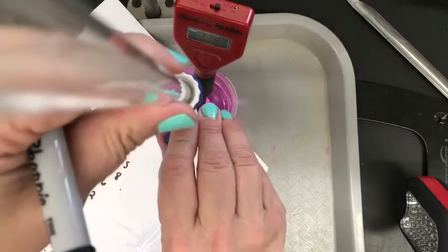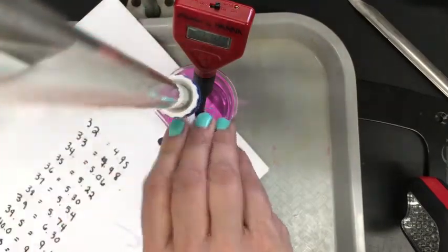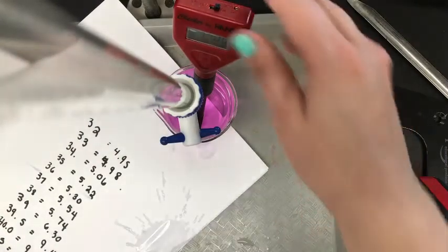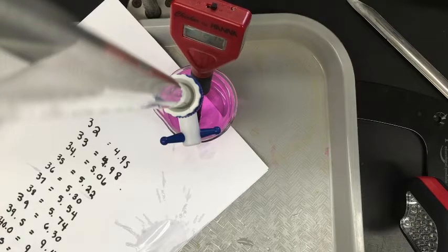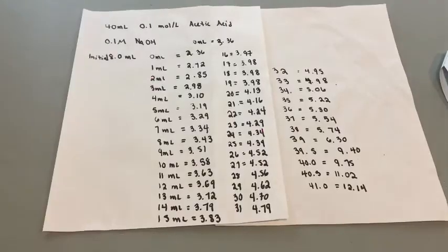And I'm going to add my last half milliliter. There's no more in the burette. So 41.0, we are at 12.14. So there's our titration. I'll record the results and show them all to you. We can see that we've gone pink, we've reached the end point.